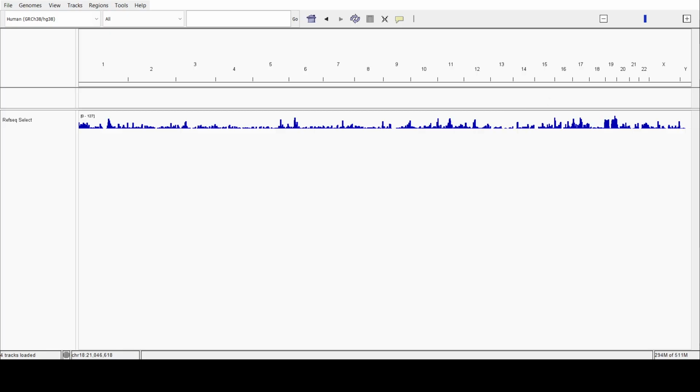Unlike the tools we have used recently, IGV has a full graphical interface, as you can see here. We don't run it in the terminal. You just go to the Broad Institute's website, download the desktop app for Windows, Mac, or Linux, or whatever system you have, and double click on the icon to open it. Basically, it's a software. When it opens, you will see a mostly blank screen. But here already a genome is loaded. Normally you might see a blank gray screen, so don't worry, we just need to feed our puzzle pieces.